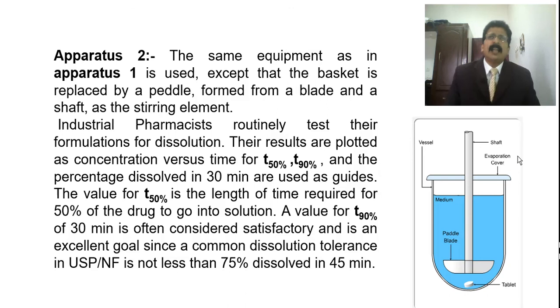it cannot release properly, there will not be any action, and it will be taken away to the feces and excreted. So it should be maintained according to the monograph, according to the BP, the United States Pharmacopoeia and the Indian Pharmacopoeia. It is necessary for any drug to satisfy the dissolution test. So see this video, so that it will give you some idea.